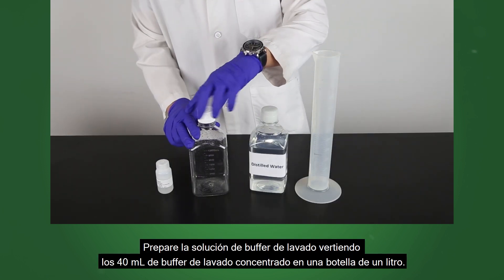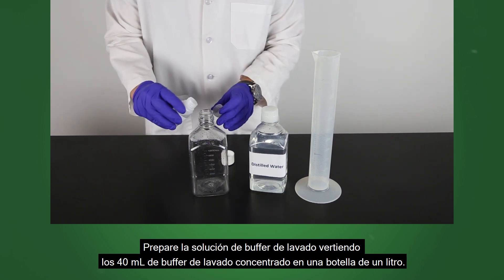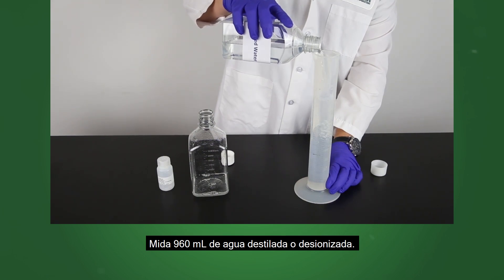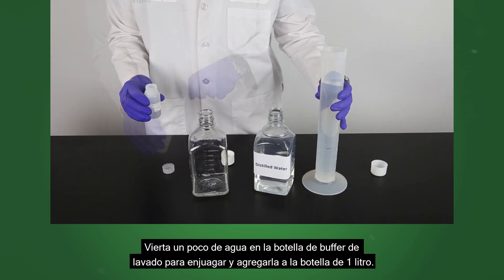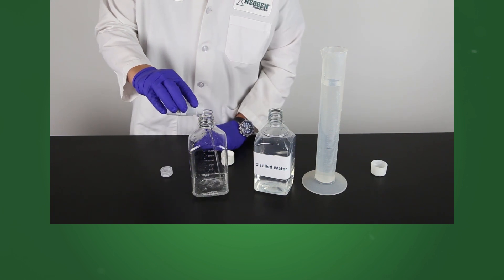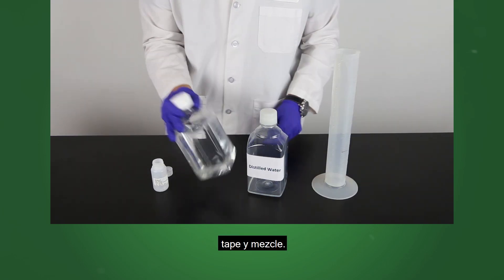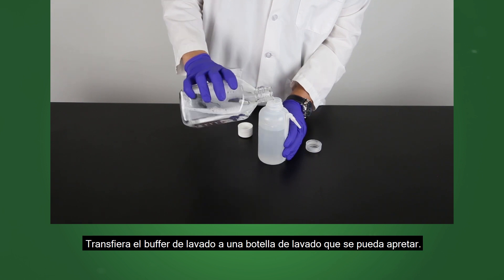Prepare wash buffer solution by pouring 40 milliliters of wash buffer concentrate into a 1 liter bottle. Measure 960 milliliters of distilled or deionized water. Pour some water into the wash buffer bottle to rinse and add to the 1 liter bottle. Pour the remaining water into the bottle, cap and mix. Transfer wash buffer to a squeezable wash bottle.